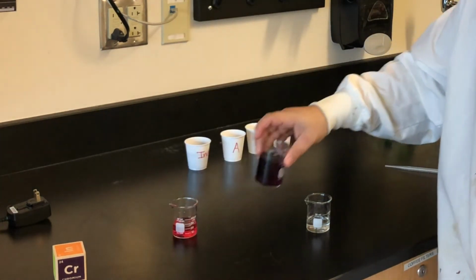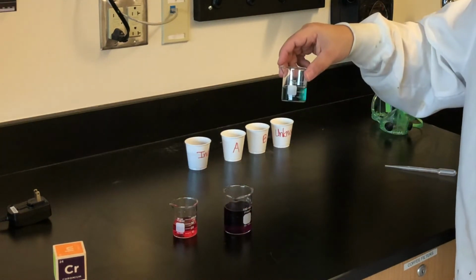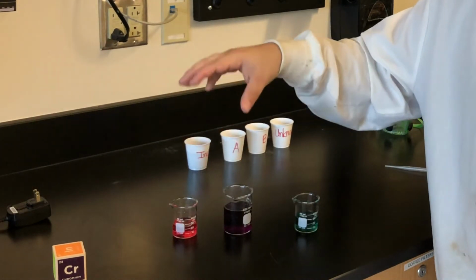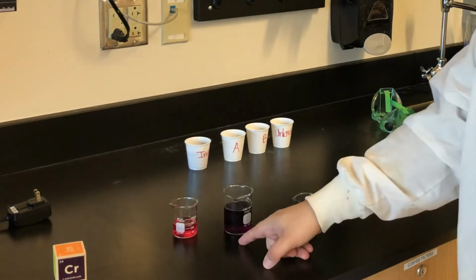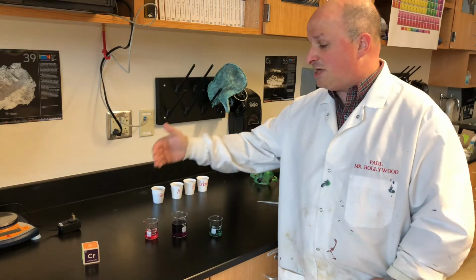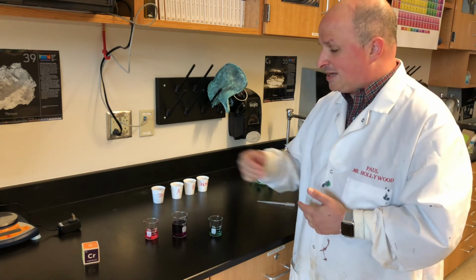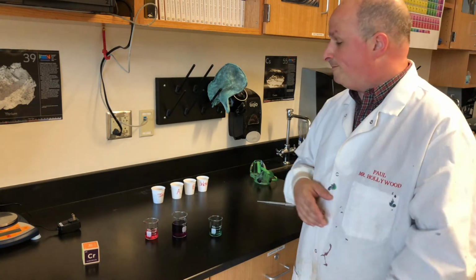And if I add it to the base, it turns a bluish turquoise color. That suggests a base. Now the way that I remember that is I think blue equals base, and whatever the other color is equals acid. So this is a low pH, a high pH, and a neutral pH. And remember that one of the critical parts about pH is that when you take an acid and a base and you add them together, you put them in the same container, they neutralize each other, they cancel each other out. It's like a game of tug of war. And if you can get the rope to stay right in the middle, that's neutral.